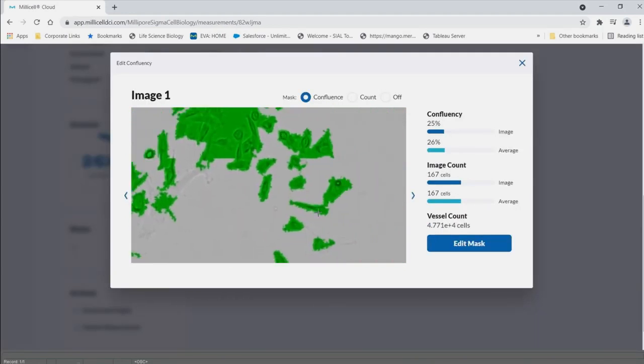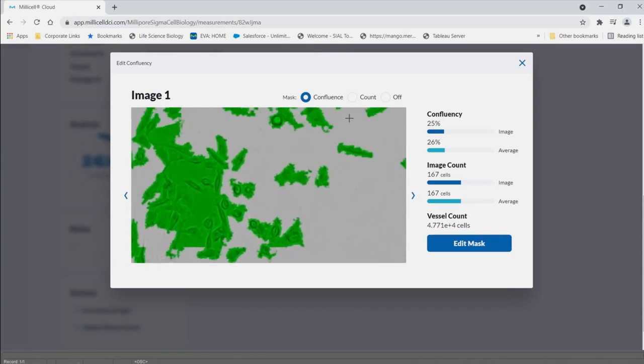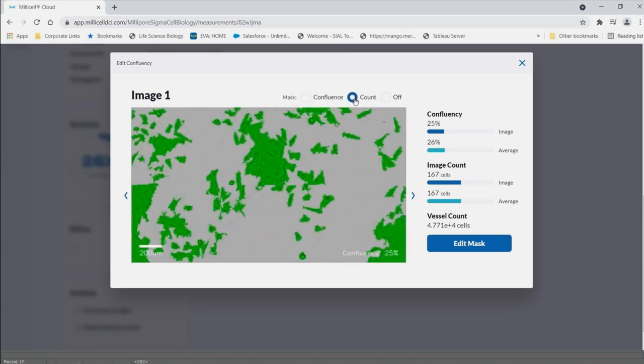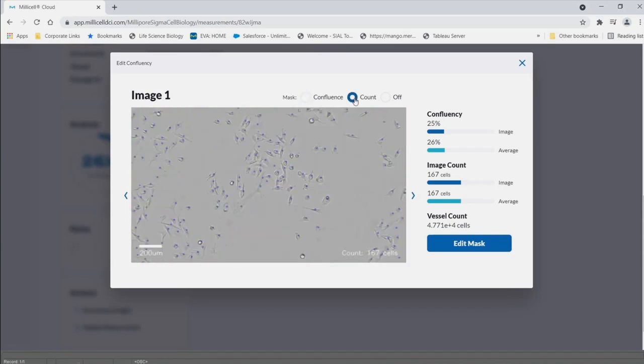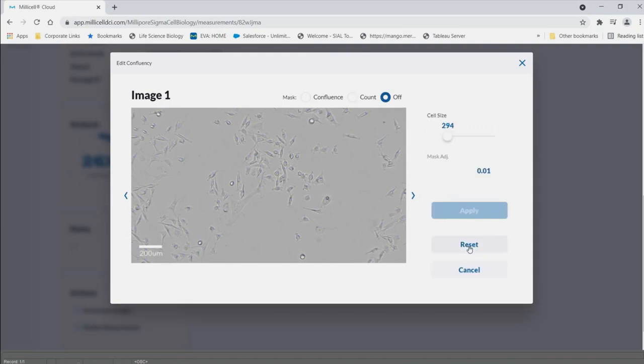Within the image analysis, you can pan over the image and review the confluency, estimated cell count, or cell count analysis.